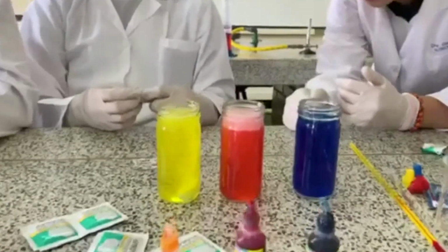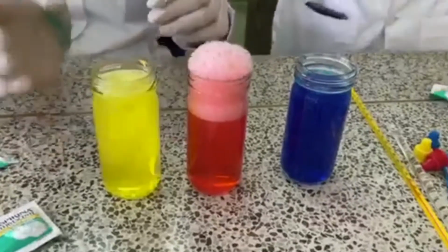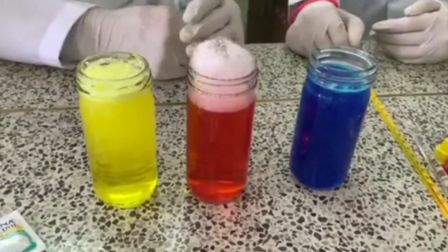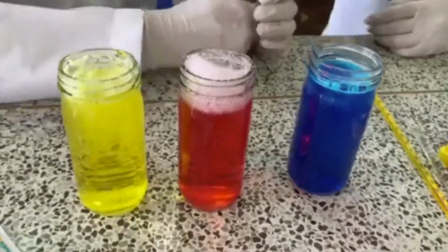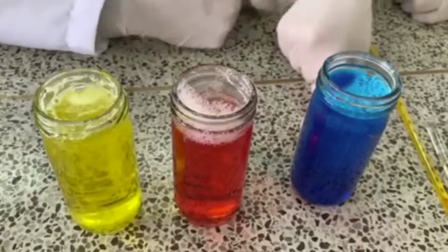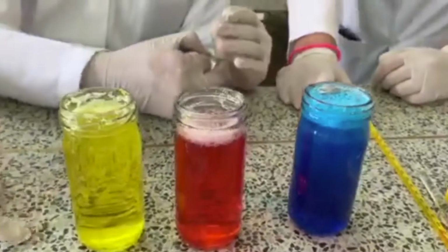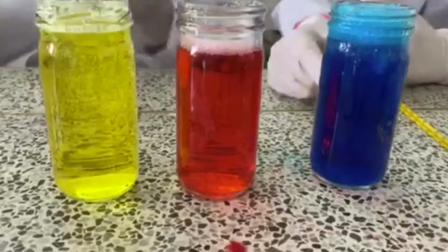Well, here is the explanation of experiment number 1. This procedure consists in determining the effect of the reaction with different temperatures. The first thing we are going to do is take 3 beakers and add 200 milliliters of water to each at different temperatures: one hot, another warm, and another cold. Then we are going to add a little dye to each of the beakers to be able to differentiate them. Blue for the cold water, yellow for the warm water, and red for the hot water.